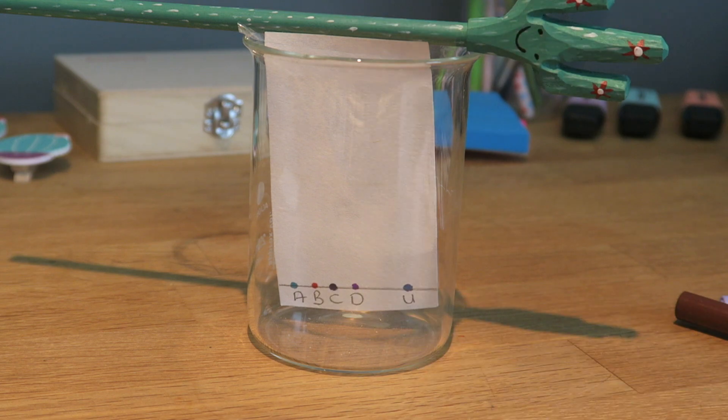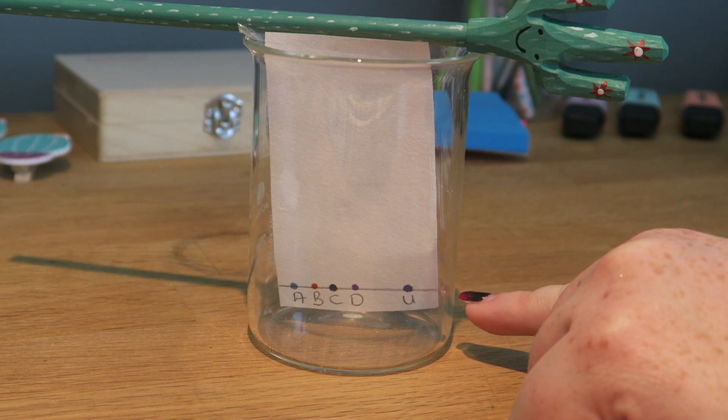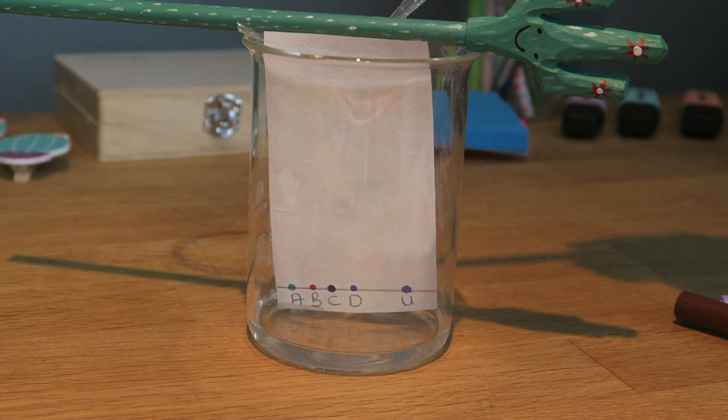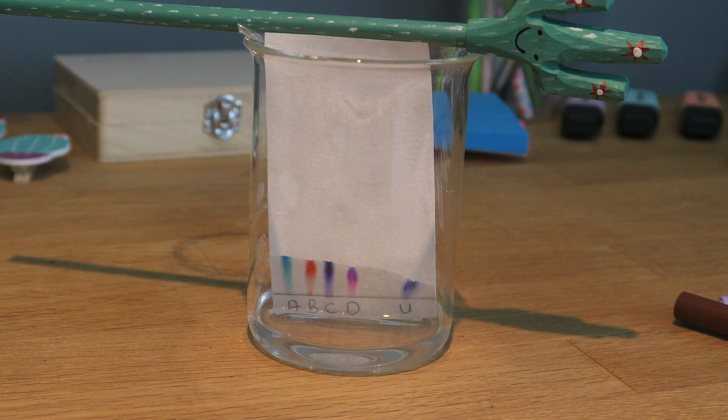I can put that in there and I'm just going to add some solvent so that it is just at the bottom of the paper. We can now watch the colours run up and when it's finished try and work out what the unknown sample is made of.